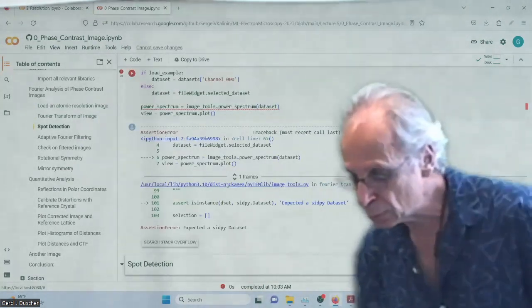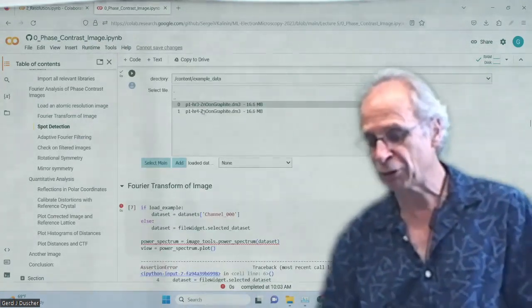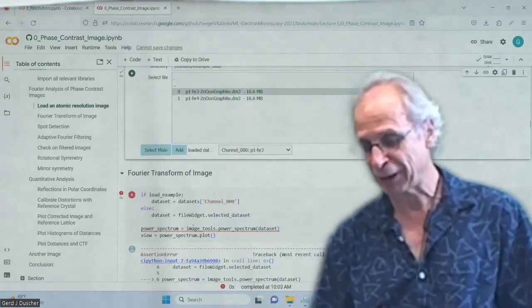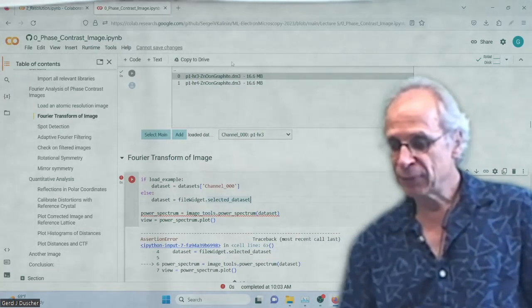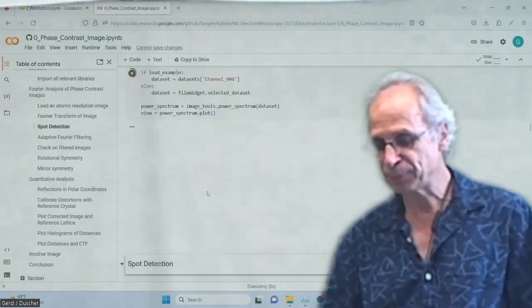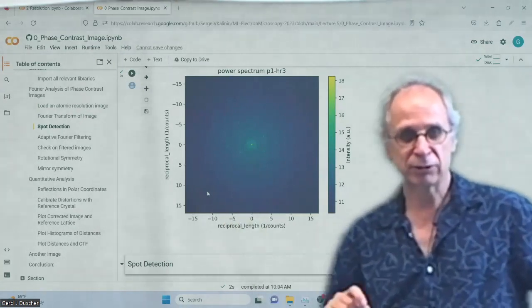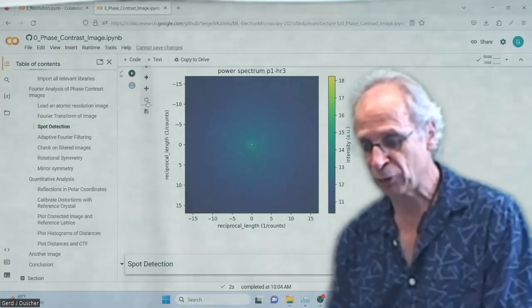Oop. Okay, we shouldn't only select it, we should select it as main. Okay, if you cannot use your own software, maybe you shouldn't give a lecture. That's an understandable thing. Okay, now anyway. So we select it here, we select it as main, and then we load it. And if we don't have anything loaded, obviously it cannot show anything. And what we see here is our diffractogram. I told you, first thing is look at the diffractogram and I'm doing it, okay?